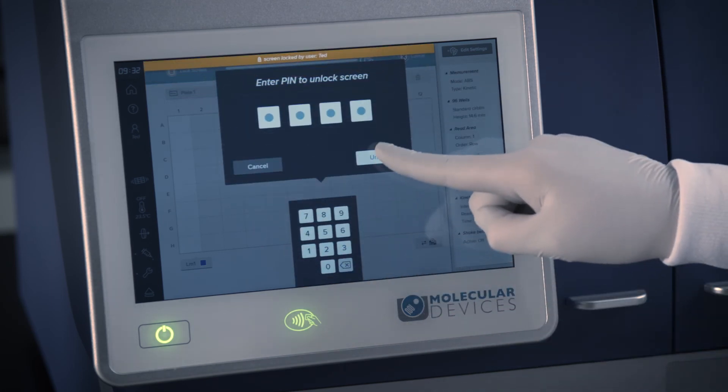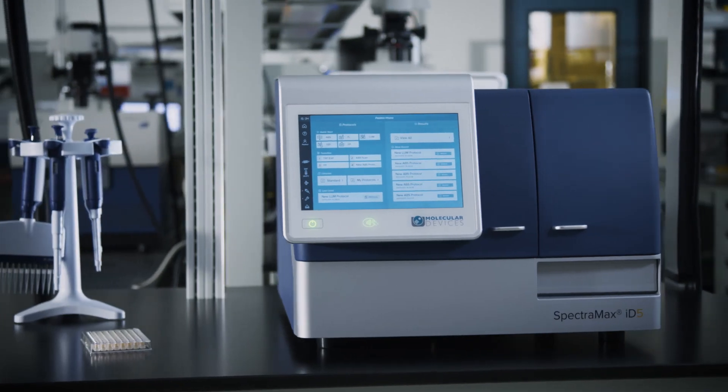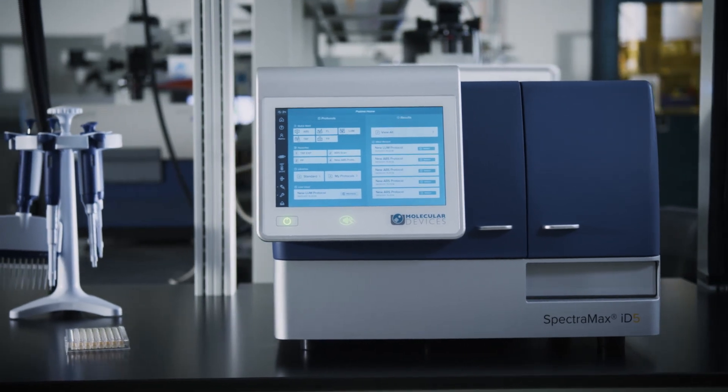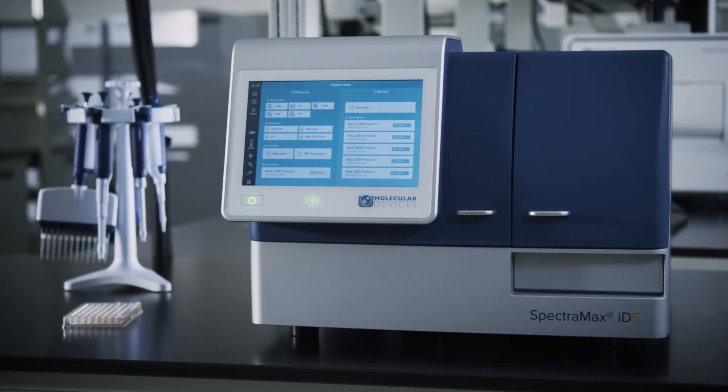With these new user management features, your lab will save time with touch screen display of personalized protocol and results files while keeping data secure in the onboard computer. Now that you have been introduced to your SpectraMax ID, it is time to start personalizing your homepage with your favorite assay protocols and results.